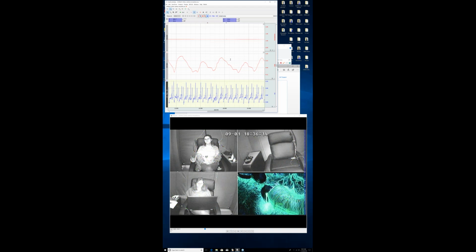Then synchronizing with the video, we would do exactly the same as what we did at the beginning. We send out the pulse to the LED, and then we look at the timing difference there. Now, one other thing that we can do is we can send that pulse again later in the recording, and we can check to see what the slip is in the system and correct for it there. I'm not sure if that completely answered Nick's question or not. Maybe he can come back with a second approach if I missed the point.